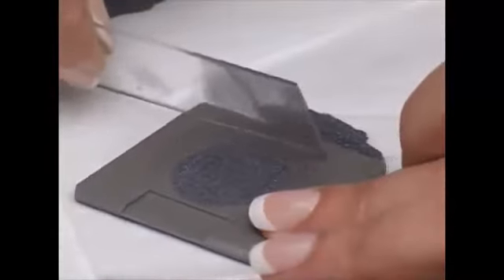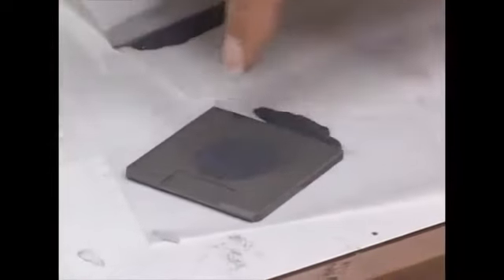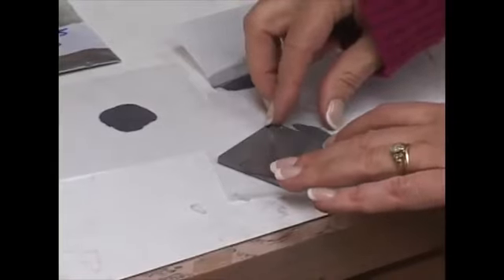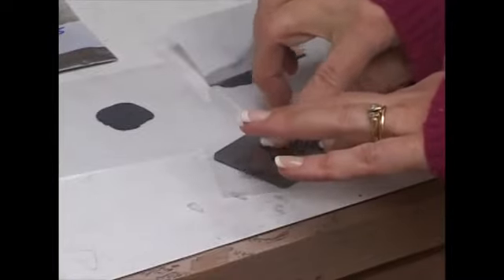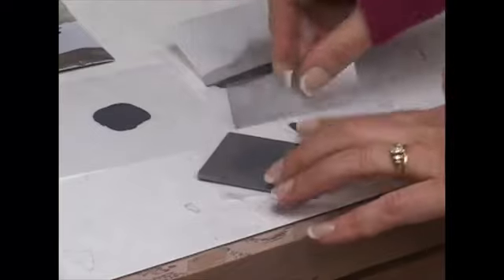And you want to keep it cleaned up, because keep in mind you're going to put this in and there are going to be 3 pins on 3 places on the sample holder, and if there's a lot of material underneath there, that's going to actually alter the angle that it's sitting at, and your positions will be off. Just flatten it down. And that's ready to go.